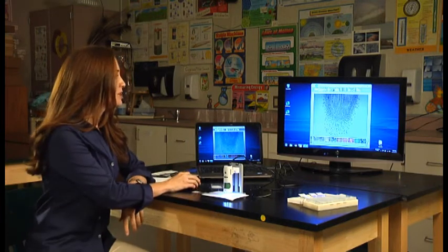First, let's take a look at onion root mitosis. To view the image in full screen, just double click, and here you can view the various stages of mitosis.